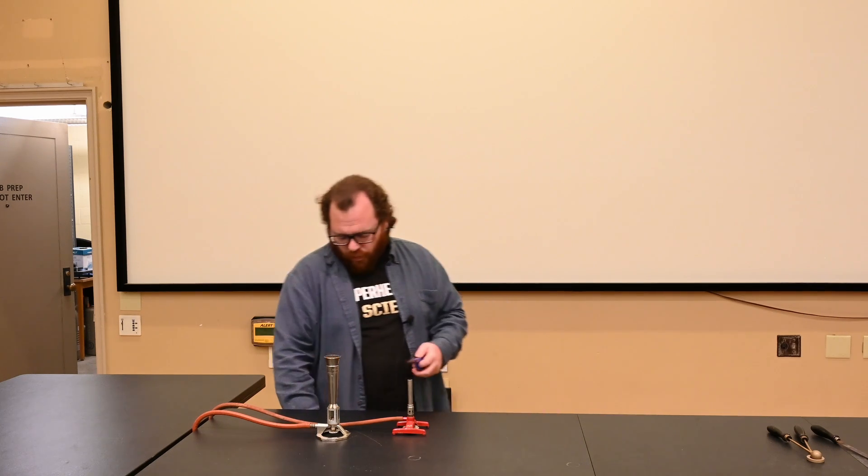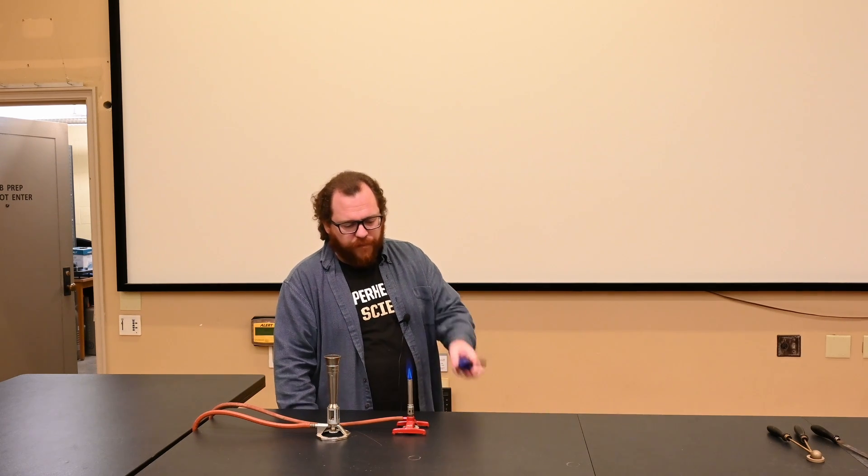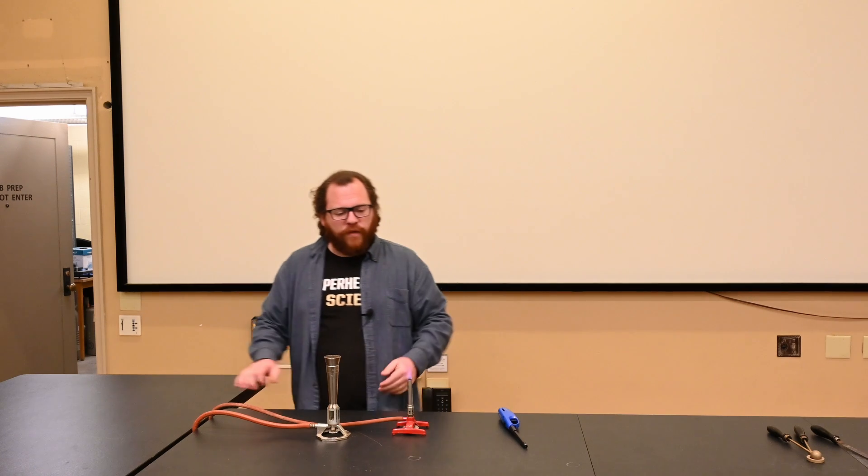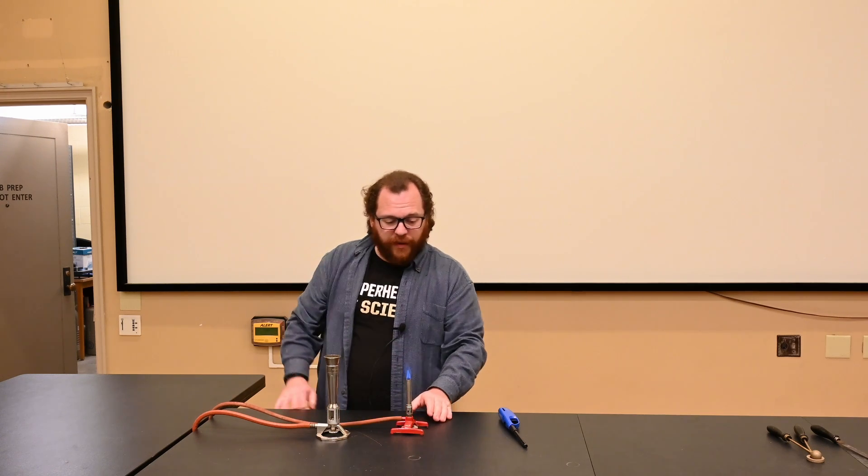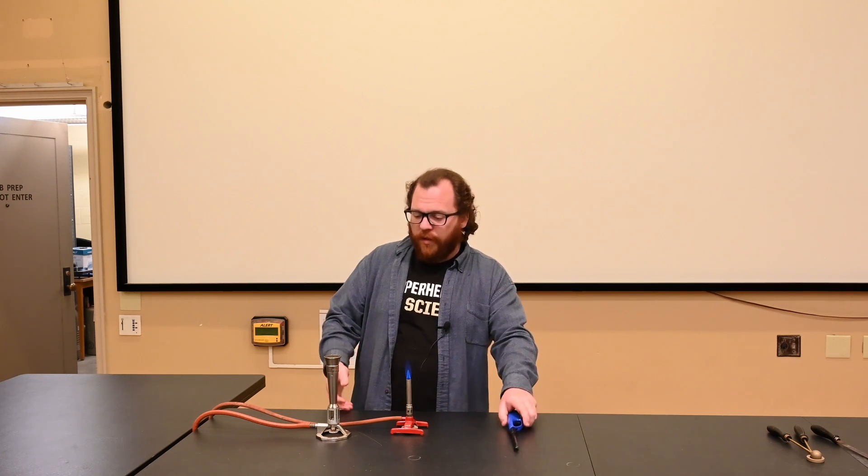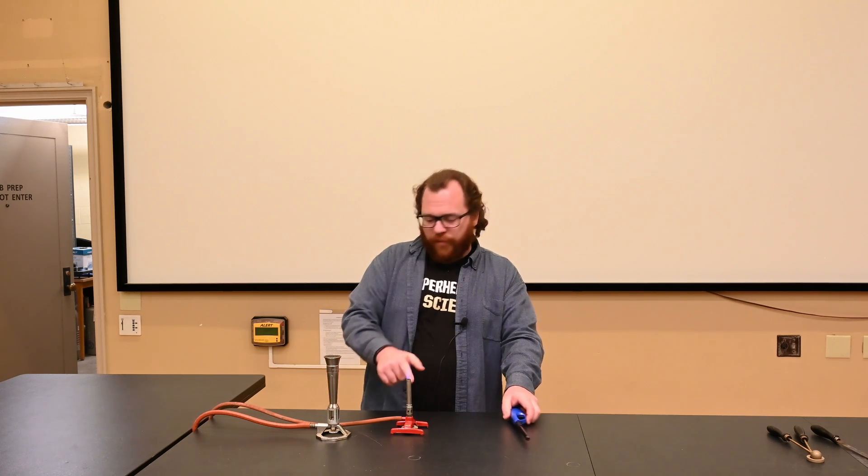This smaller one right here is a Bunsen burner. So when I light it, I get one flame. It's very nice and you can control the size by adjusting the knob at the bottom. And if it's completely off, sometimes you think the burner is not working because no gas comes out when it's totally closed, but this is a Bunsen burner.